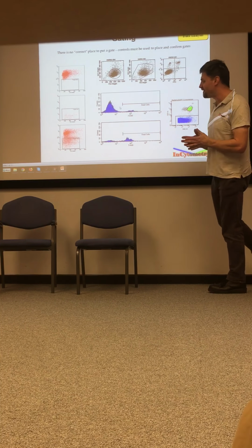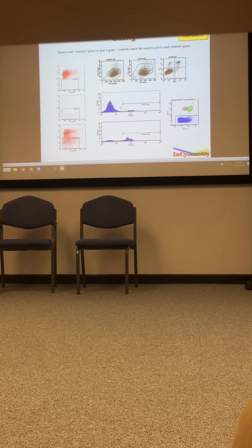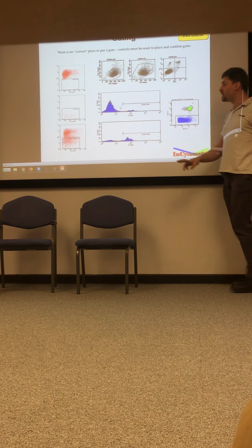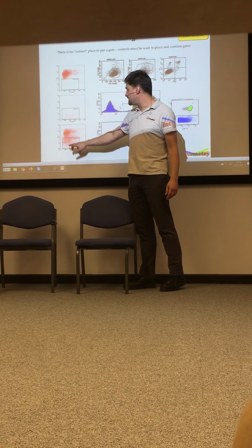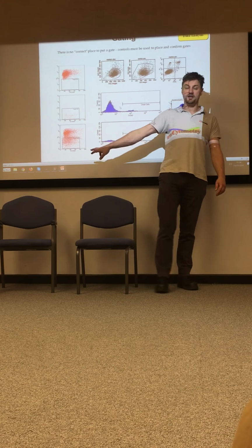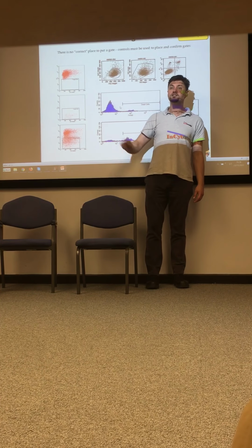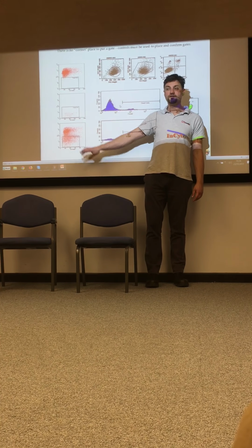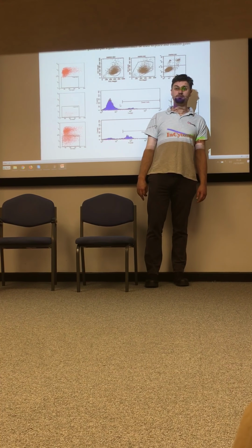Of course, I can qualify that by saying there is a way to work out the best place, and that is generally using experimental or biological controls. So, for example, here's my NK assay: NK cells, target cells. So that's my target cell gate. If I stood up at a conference and put this up, someone would say, why did you put the gate there? If I said, it looks about right, no one's going to give me any respect whatsoever.